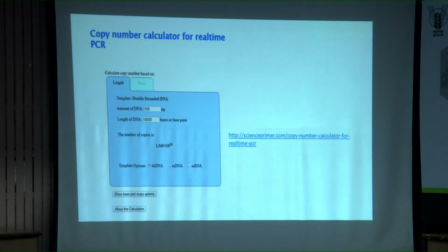You come to this stage with two input data. One is the amount of DNA, which you can always calculate with the help of Cq or Ct values. And you know the size of the gene in base pairs. Correct? Only these two things are needed, and both are generated by you using your real-time PCR machines. Correct?